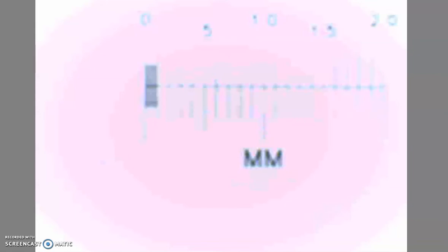This really helps us to understand the comparison of things. So in order for us to do that, the first thing we have to understand is how big is the area that we are actually looking at. So with your microscopes, you are going to follow procedure 2.3 and actually measure the diameter of our field of view. Now we have three objectives, right?